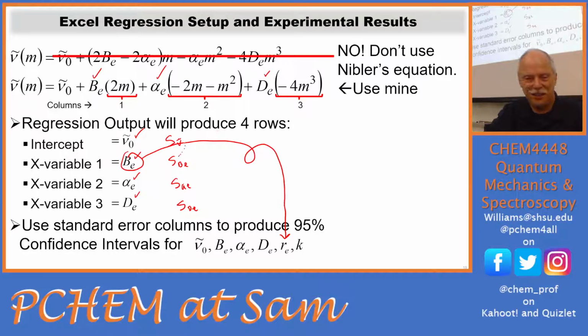And you've got your uncertainty here, and we're going to introduce propagation of uncertainty, and we're going to get our uncertainty for the bond length. And so you'll see how sure you are in angstroms of that bond length. You should have uncertainty in like the 4th decimal place of bond length if you did your assignment correctly.